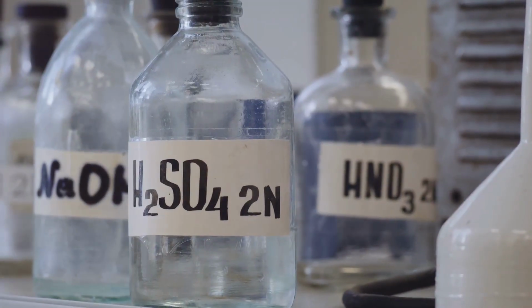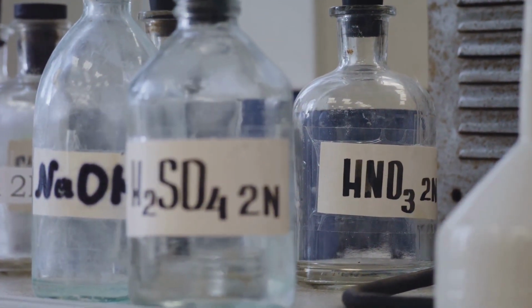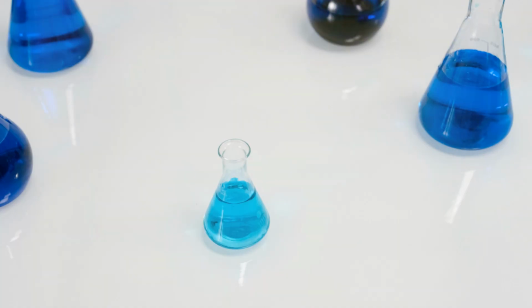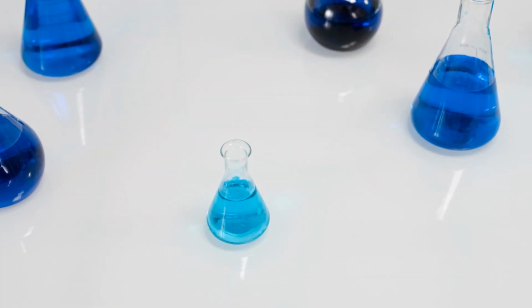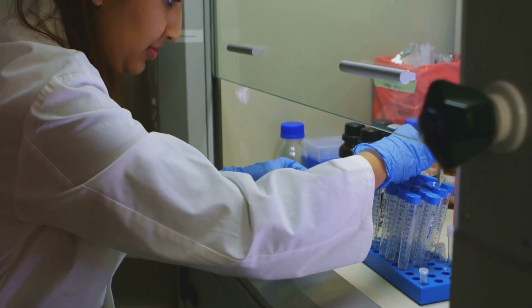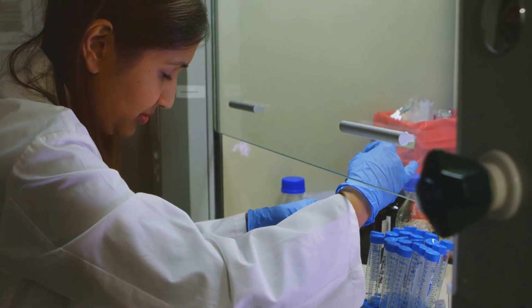For structural studies, you'll want detergents that form small, uniform micelles. DDM, C12E8, or OG are popular choices. These detergents help maintain the protein's shape for imaging or crystallography. Sometimes you'll need to screen several detergents or even swap them during crystallization trials to find the best fit for your protein stability and crystal growth.